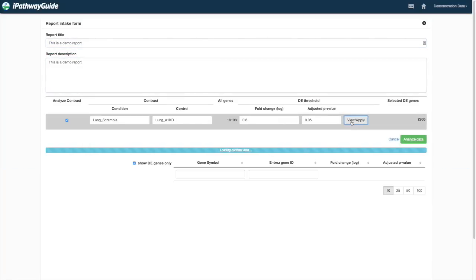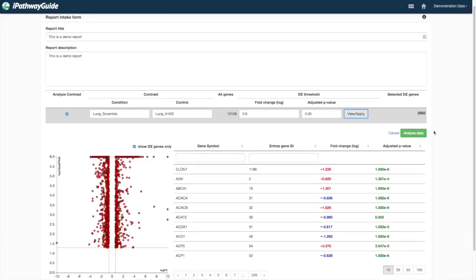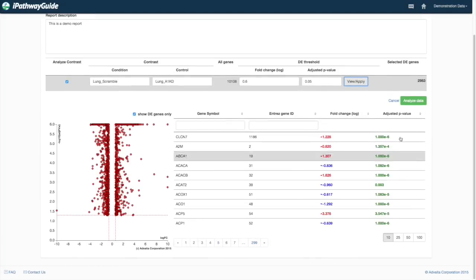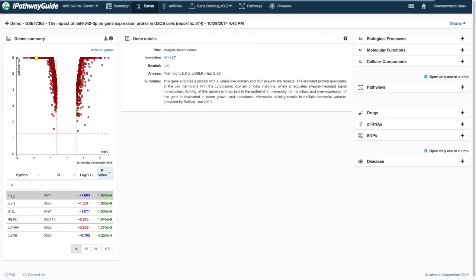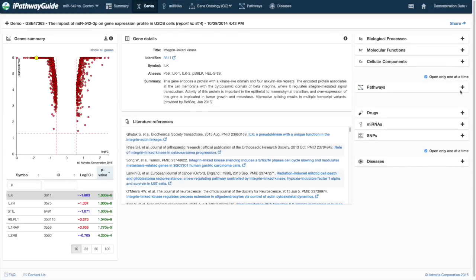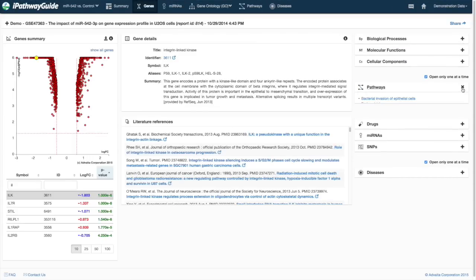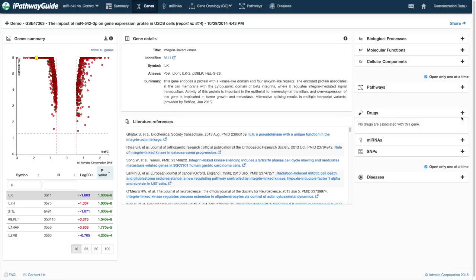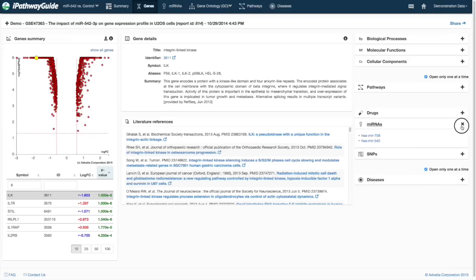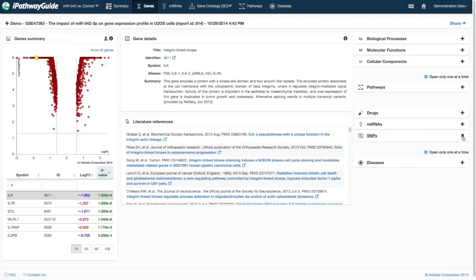iPathwayGuide allows you to easily adjust your thresholds for both p-values and fold changes. Unique features of iPathwayGuide include a gene browser with annotated relationships to ontologies, pathways, microRNAs, variants, drugs, and diseases.